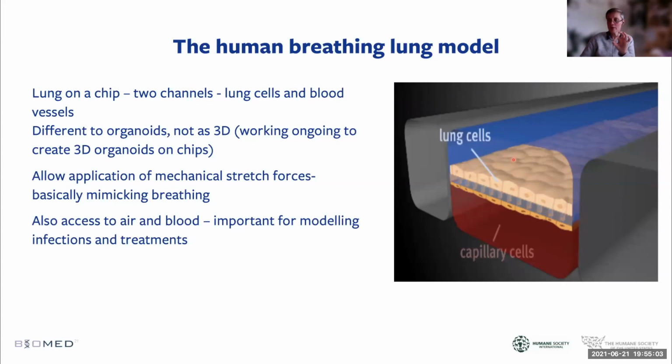And then what's more exciting is that this is not my work, obviously. This is Dan Hu from 2012. They looked at what might address this. They found that angiopoietin 1 actually stabilized the endothelial junctions and could prevent that leakage in this breathing lung chip. So we have a mechanism for why this is happening, and we have a way to address it as well, using this fantastic in vitro model.